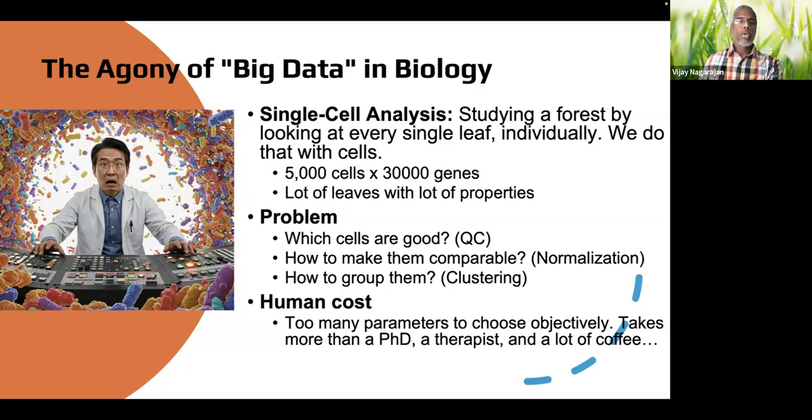So I picked R as my main platform. Python is popular and famous. R is next in line to Python, even in data science. I chose R because at that point, like 3-4 years ago, Seurat was all we were using, Seurat and Scanpy.